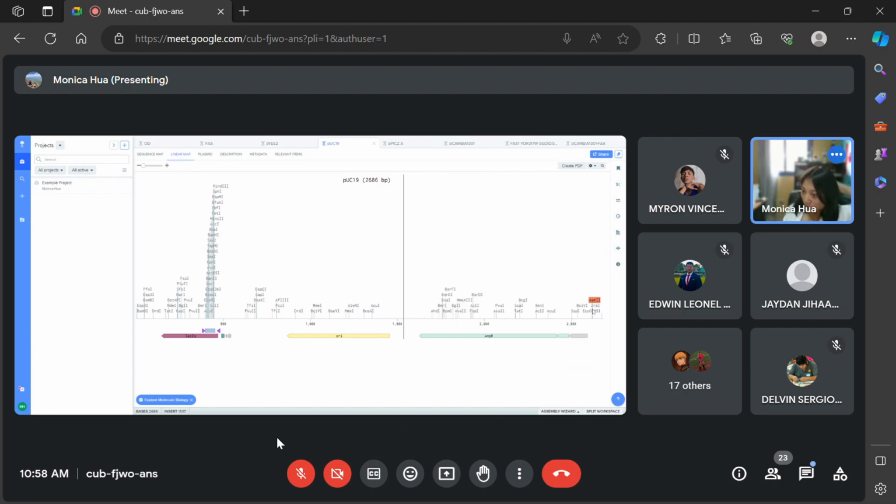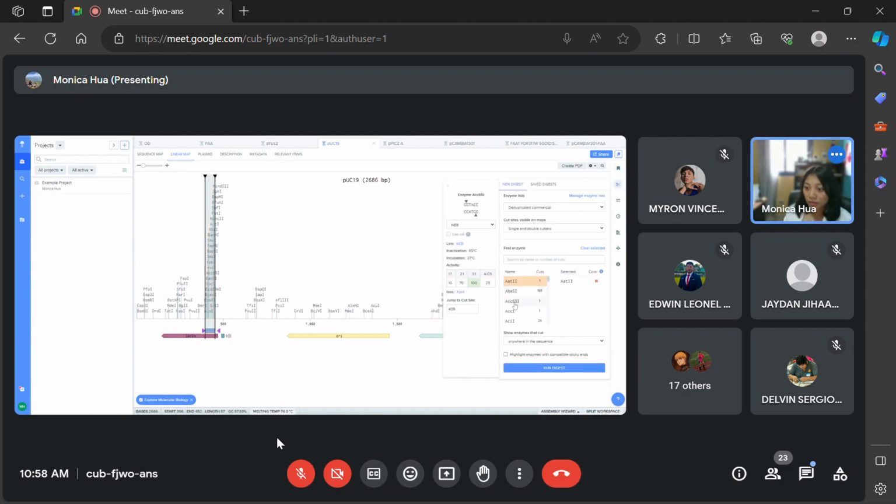So let's say I select, wait, I don't want AatII. I want something in this site. So let me see, where are these ones? No. Okay. I'll do it.